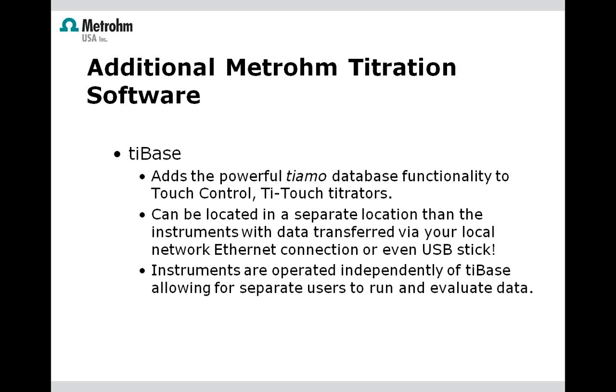It complements a standalone system quite well in that you can automatically have your data sent over from your touch control system. In addition to having that automatically connected to a network by Ethernet cable, you can also manually take your USB stick with your data and import it into your T-base system.